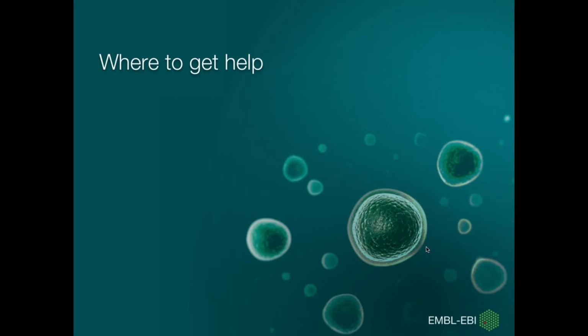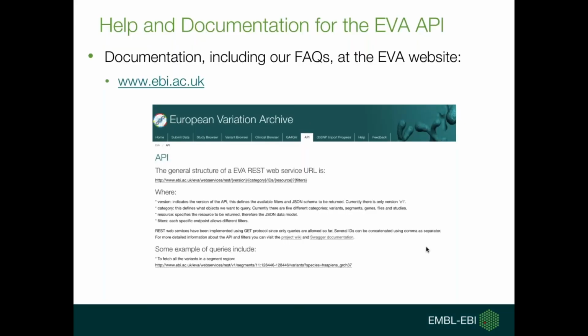Okay, so now we've looked at some use cases of the EVA API, and Pablo has provided a Python script that we can find online of exactly how to do what Pablo was doing there, which was searching certain studies for certain variants within certain regions. We have documentation on our website that provides help for the EVA API. We have a specific website which you can reach via www.ebi.ac.uk/eva. And within the website, we have a dedicated page for the API.